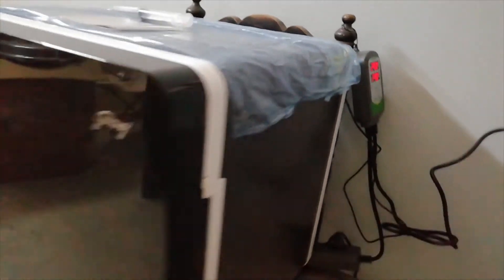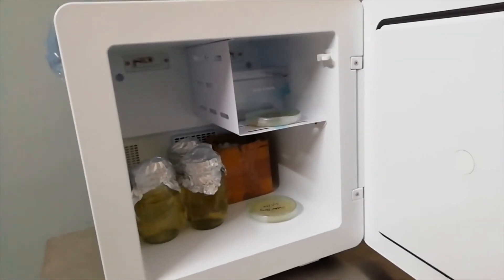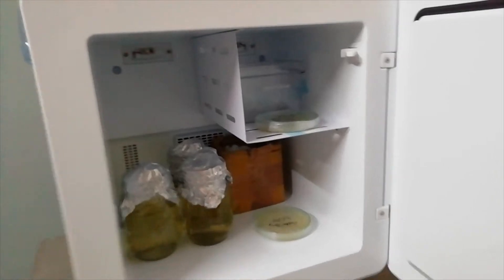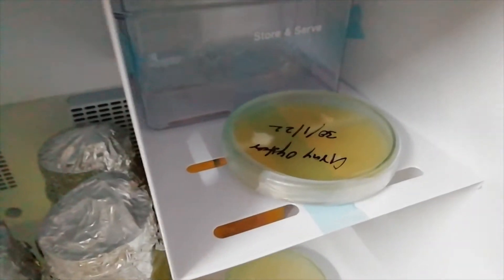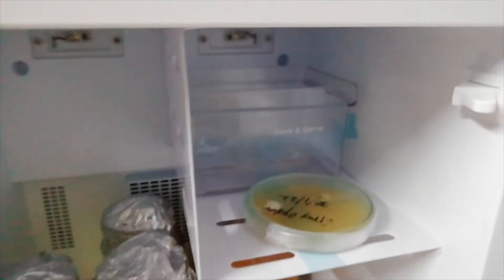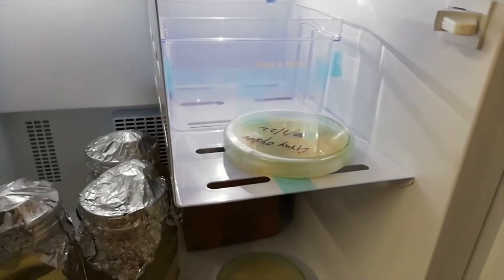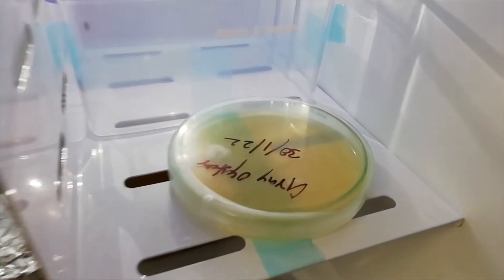Since I'm using this for my mushroom petri dish storage and liquid culture storage, I am using this small refrigerator. We can store petri dishes, liquid cultures, and whatever needs to be stored under 24 degrees Celsius.